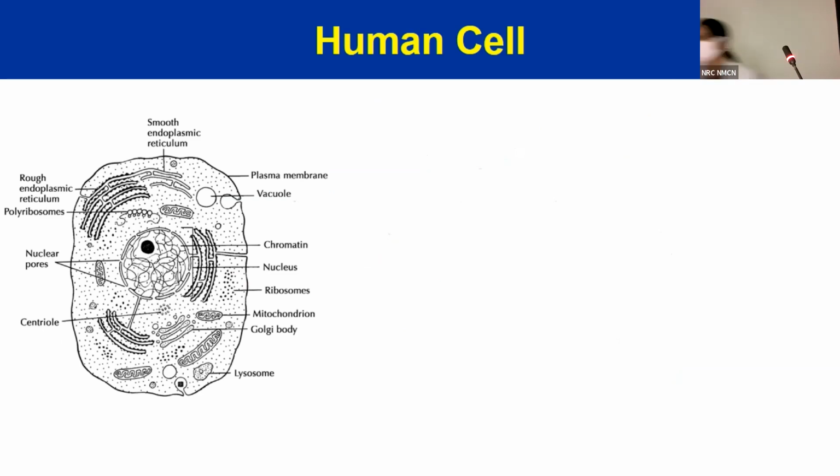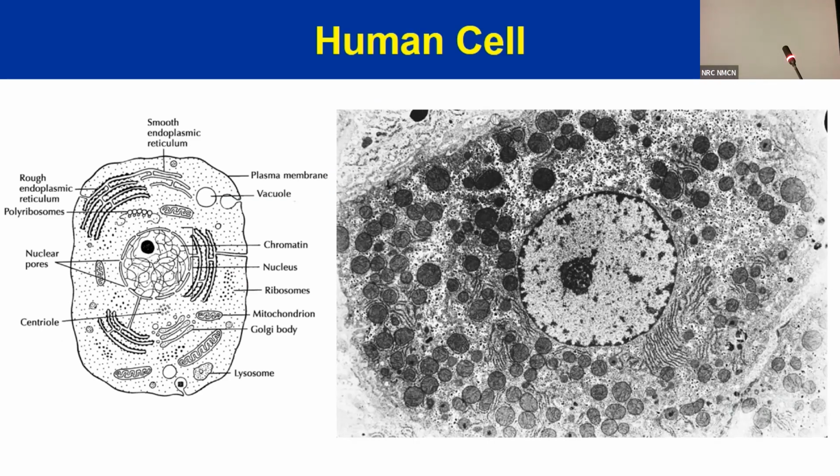And as pathologists, we are able to look at it each day under the electron microscope. This is how it looks when we look at it. This is a hepatocyte, a liver cell. This is how it will look under an electron microscope. So now you can make out these are the mitochondria, right? And these are, what are these?